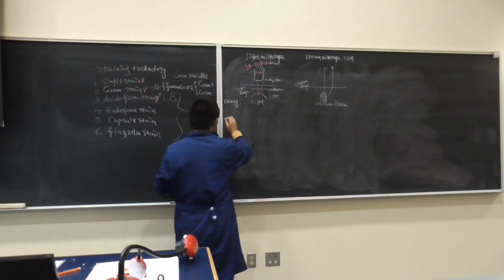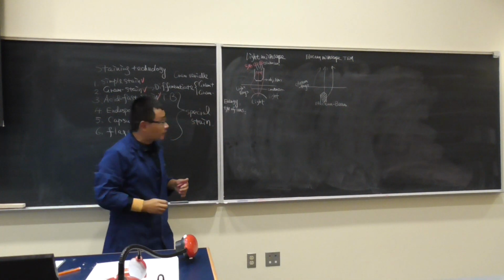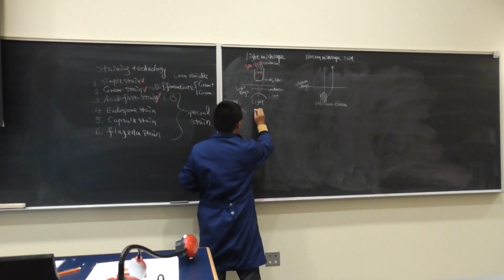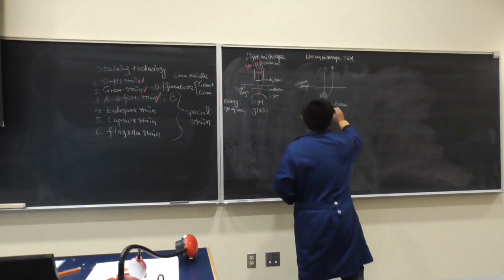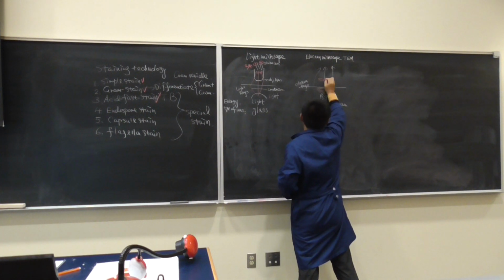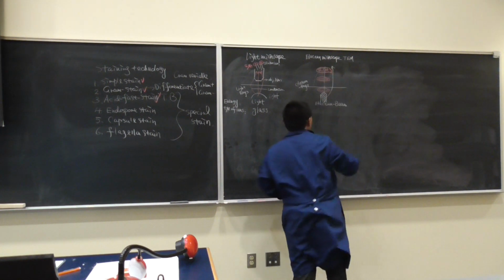Okay, then the second thing is type of lens. Did you notice that your condenser, your objective lens and your ocular lens are all glass? And I said it's very expensive, don't block it. Then how about the electron microscope? It looks like a circle. One is here, second one right here, another one is on the top. And people make a joke for your understanding.